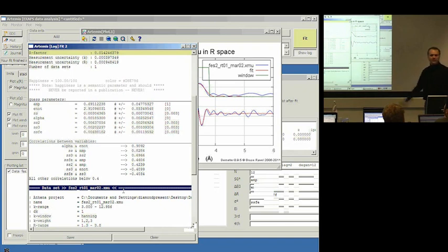So that's a problem we're going to need to think about at some point in the investigation of this fit. It's a problem with the fit. That is a number that we could not easily publish because it's not a number that we could easily defend. So that's a problem.